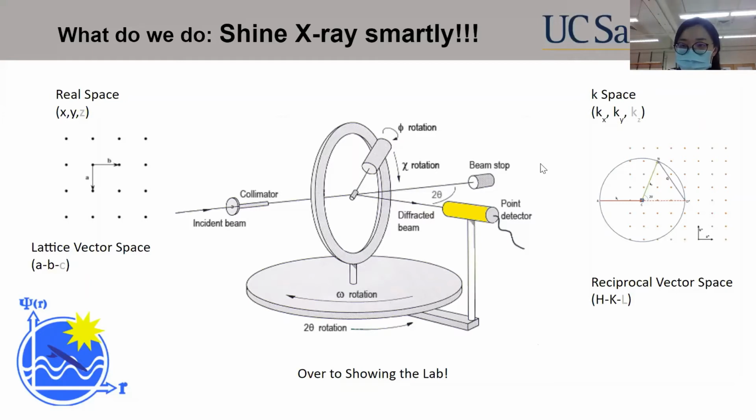So the goal of all this is to show you the three-dimensional lattice spacing in the X, the Y, and the Z directions. And that kind of tells you what kind of crystals your material forms. Is that correct? Sorry, can you ask the question again? Sure. So the goal is to use this diffraction to show you the lattice size in the X, the Y, and the Z direction.